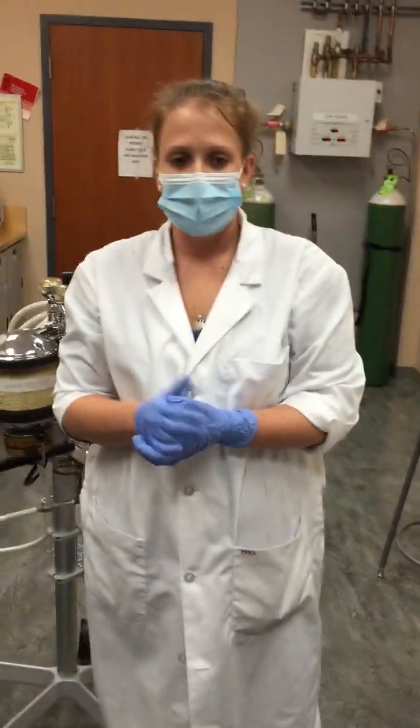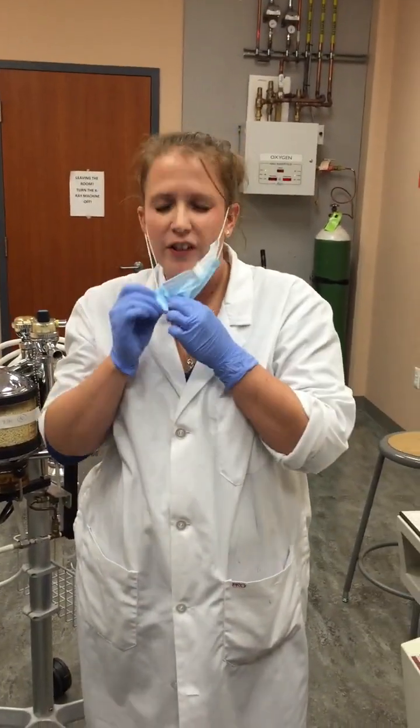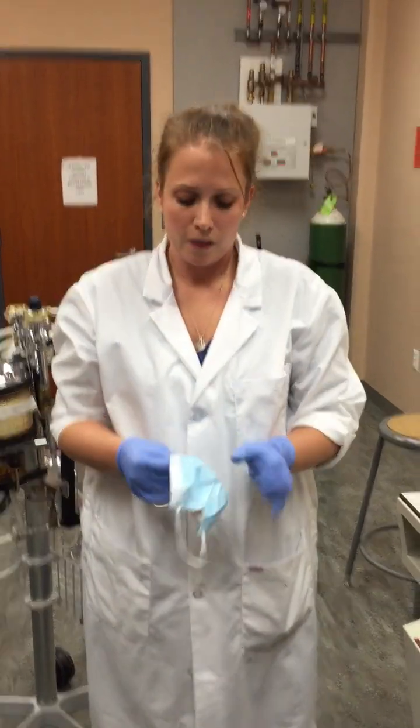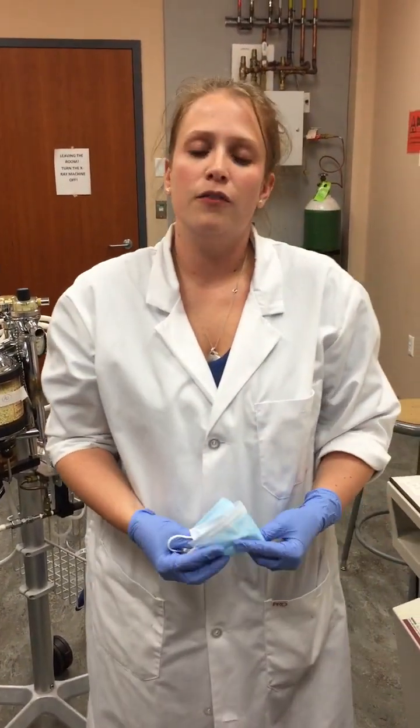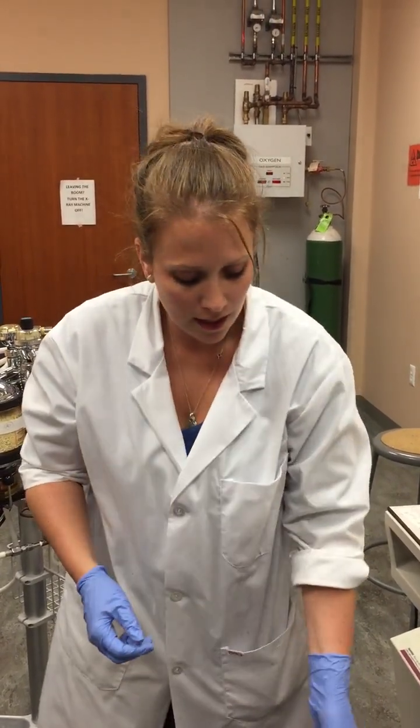If you have any further questions, please refer to the SOP for that information. And again, if you are pregnant or if someone that you work with is pregnant, please do not do this in their vicinity. Thanks.